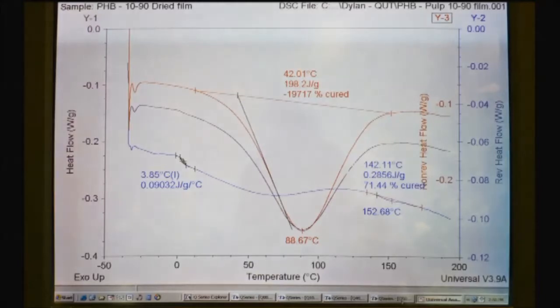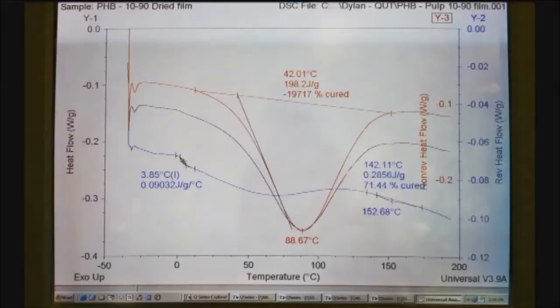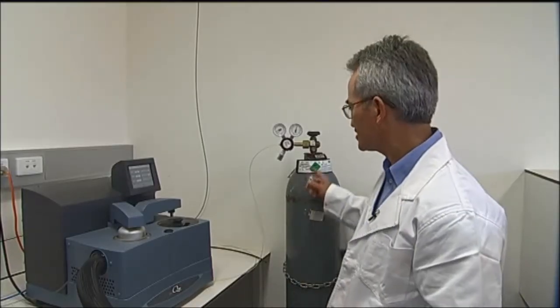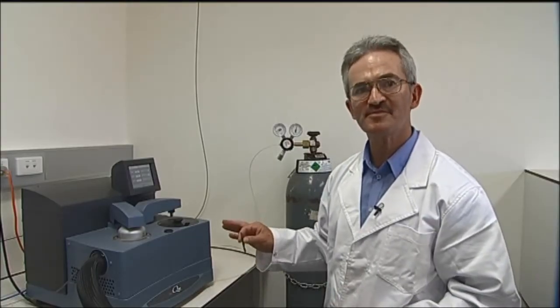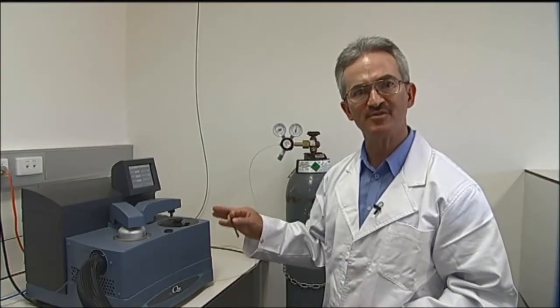Depending on the thermal properties of the sample you want to measure, you can set the software for the tests you want: standard, for the determination of the total heat of reaction, or the modulated DSC, also known as MSDC, for such properties as the Tg value, the melting temperature, and the degree of crystallinity. The DSC analysis is done under nitrogen gas to minimize oxidation reactions and obtain only the thermal properties associated with the polymeric material.